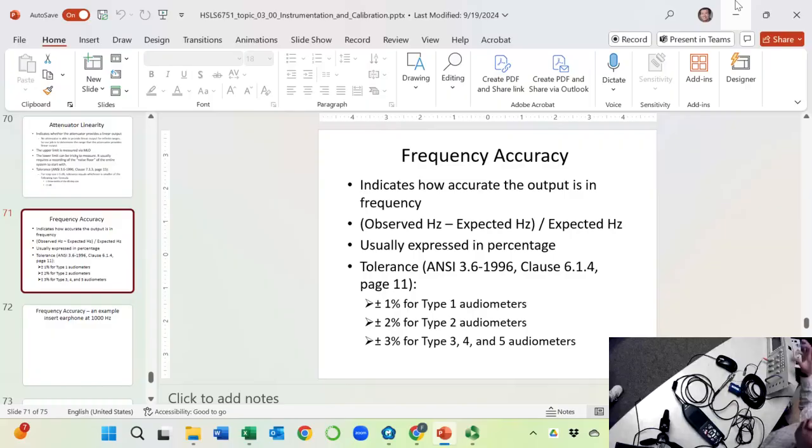I want to zoom in so I can measure the location of the peaks more precisely. Does that make sense? So let's see if I can do it right. Horizontal. Here you go. Now I can see two peaks properly.